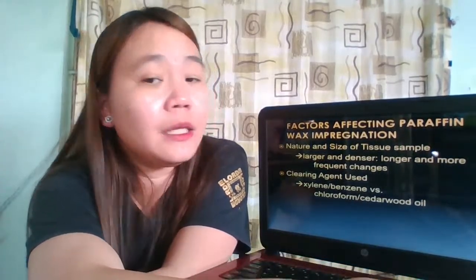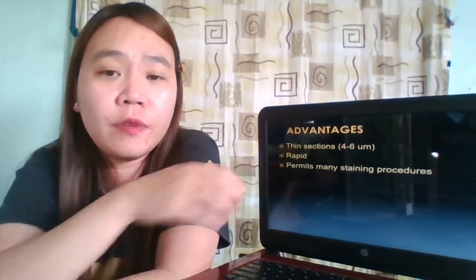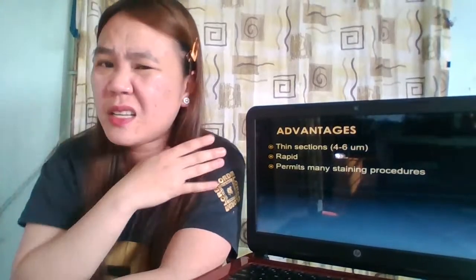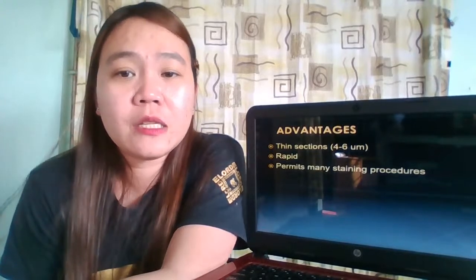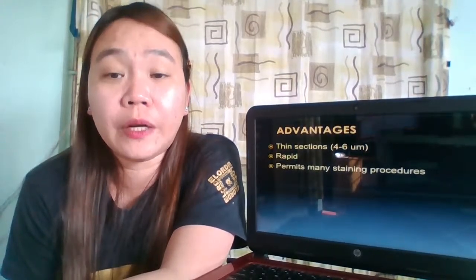Okay, so now what are the different advantages of paraffin impregnation? So the first one, paraffin impregnation and embedding.